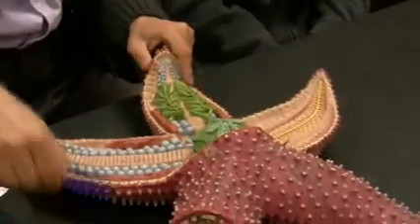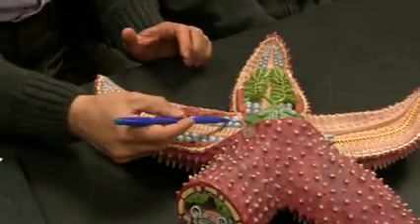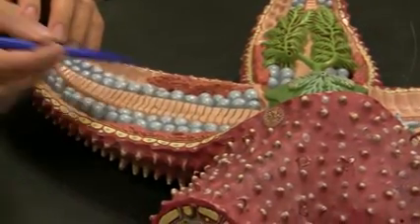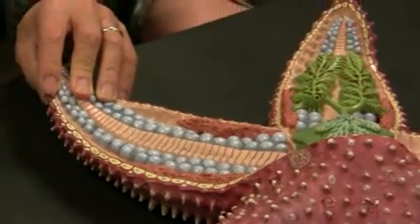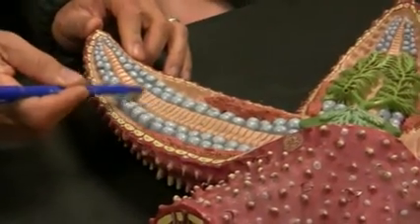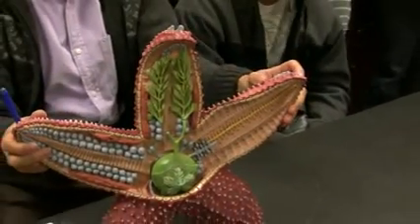So you have the digestive glands, underneath are gonads, and then you move all of those. You see these bulb-like things. Those are ampulla. You've heard that before. Osmoregulation in what organism? Paramecium. You've heard that before. This is the ambulacral ridge, which I will talk about in lecture. They have an eye at the end of each arm. Now again, light intensity, not image. They do not form image.